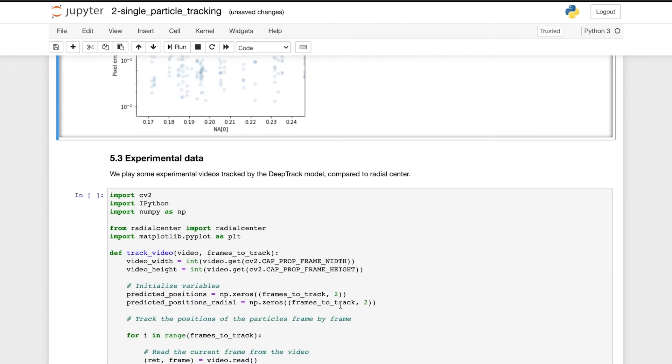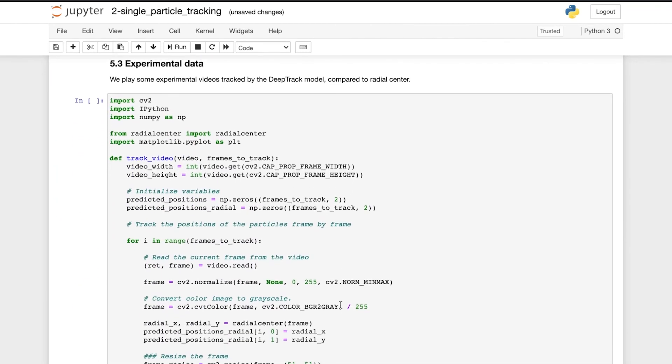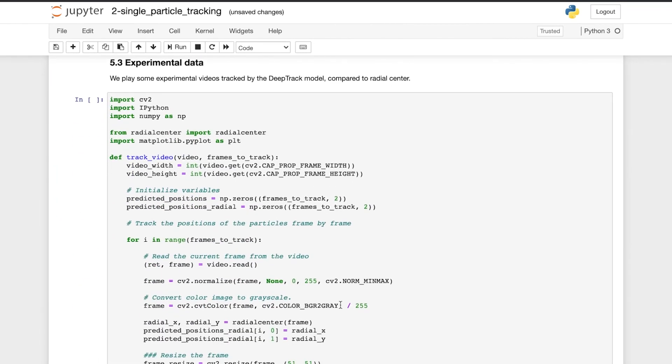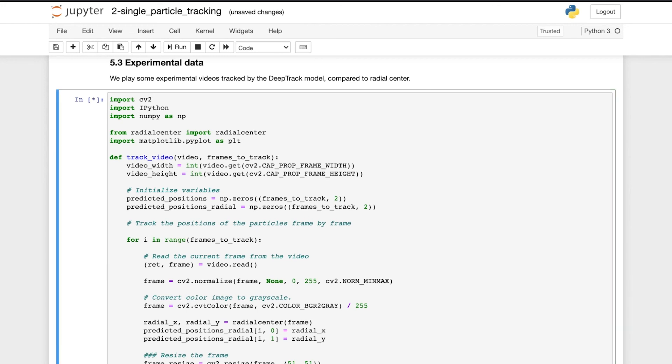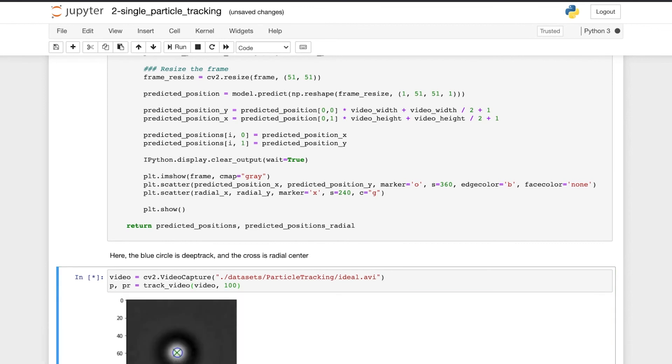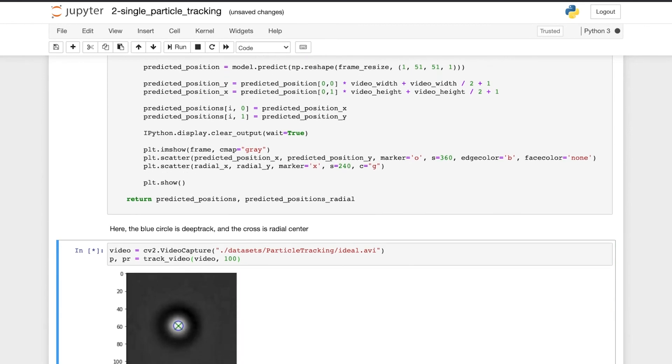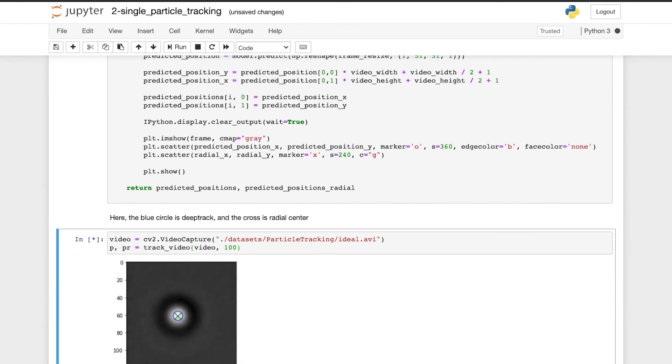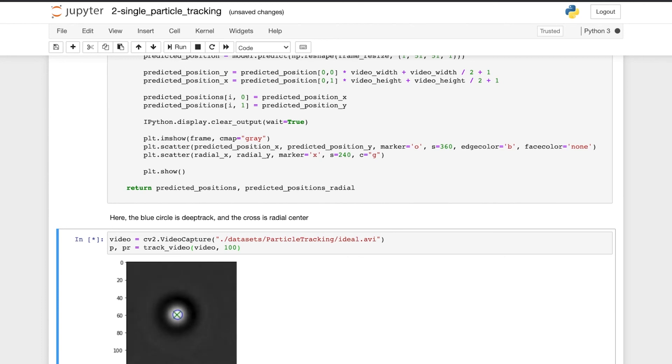And finally we test the model on some experimental data. We track two videos with the model we have trained, as well as with a standard radial symmetry method. The first video is of an optically tracked particle in good imaging conditions. The blue circle is the tracking from DeepTrack and the green cross is from the radial symmetry method. We see that both methods are able to track the particle very well.